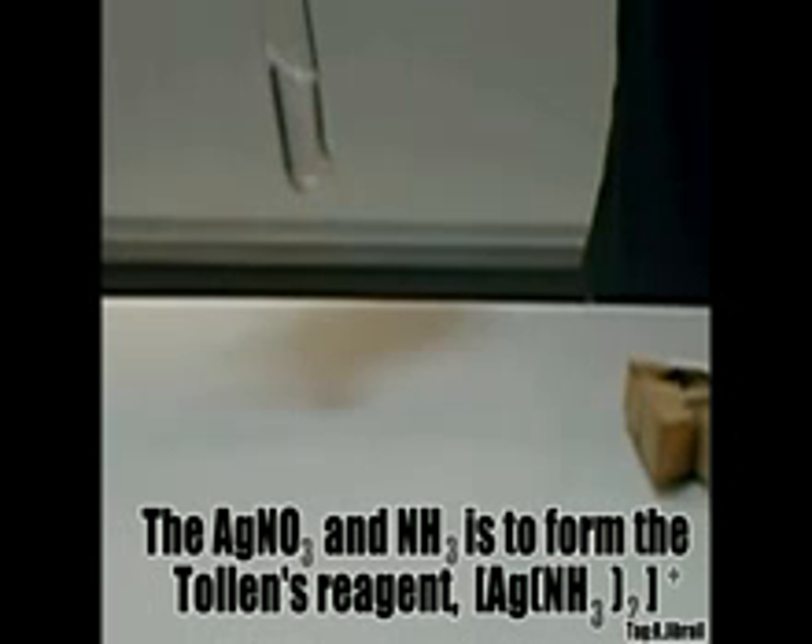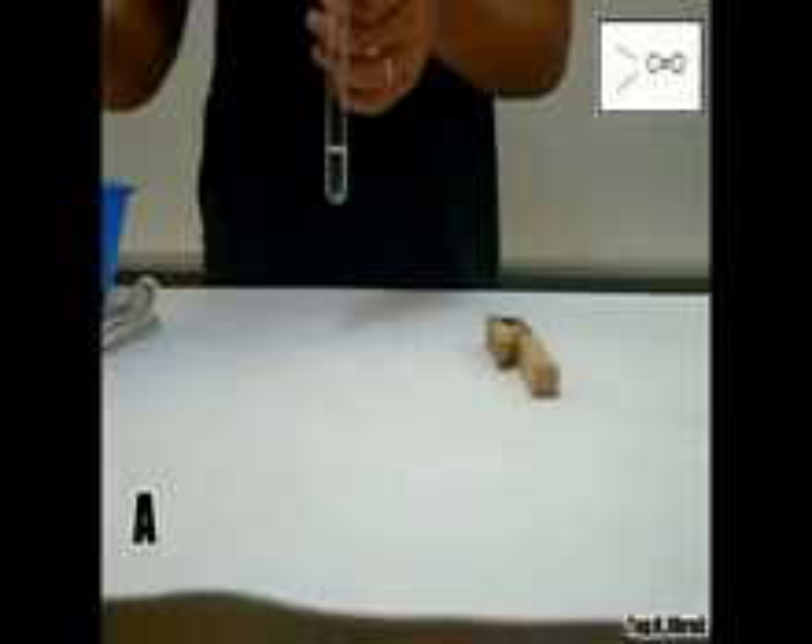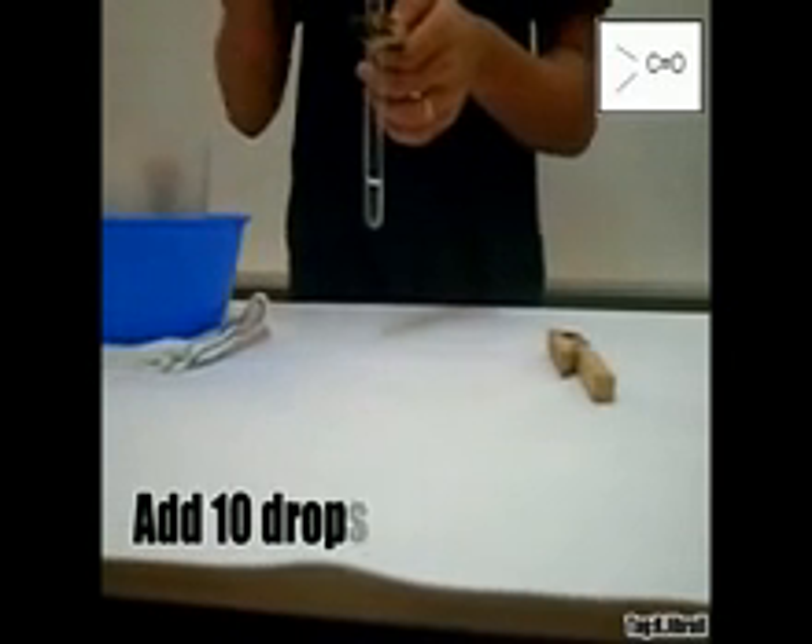The purpose of the AgNO₃, silver nitrate, and NH₃ is to form the Tollens' reagent. After forming the Tollens' reagent, add 10 drops of the carbonyl compound.